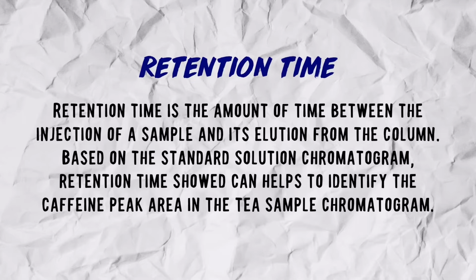Retention time is actually the amount of time between the injection of a sample and its elution from the column. Based on the standard solution chromatogram, retention time can help to identify the caffeine peak area in the tea sample chromatogram.